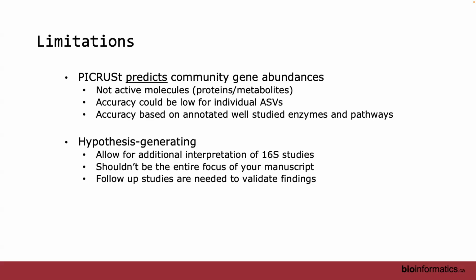Yes, from the output, but does it tell you the percentage of your features that were identified with PICRUSt? Do you know how much of your dataset it got info from? The functional features? Yeah, were all of the ASVs included, or is it only like 20% of the ASVs? So, sorry, what? I said, you want me to take that?